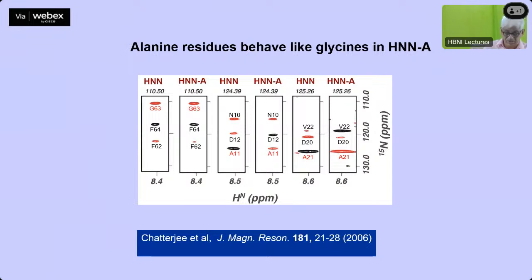Sequential work can be done through this. In all of these, the glycine plays a very important role. I'm just saying in words what I already showed last time. The glycines play a very important role because they create a certain kind of peak pattern in the various cross sections of the three-dimensional NMR spectra. The so-called F1, F3 planes have direct display of the correlations. They allow you to identify the N15 chemical shifts of residues I minus 1 and I plus 1 and the NH proton chemical shift of residue I. So sequential correlations are immediately seen.